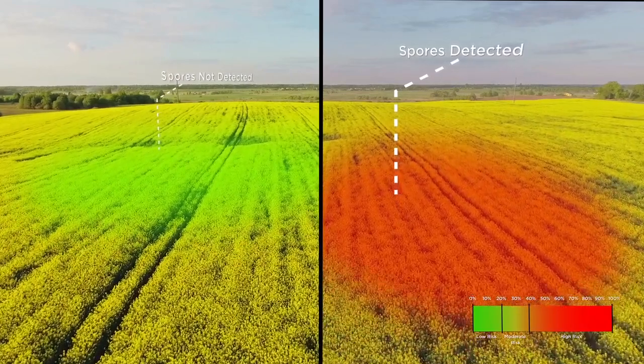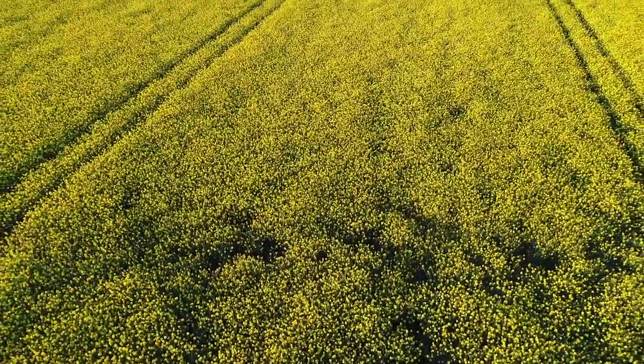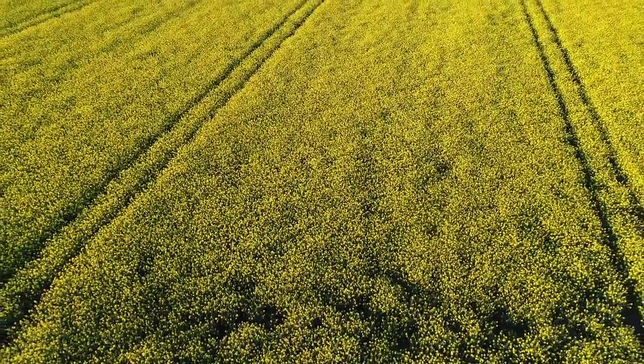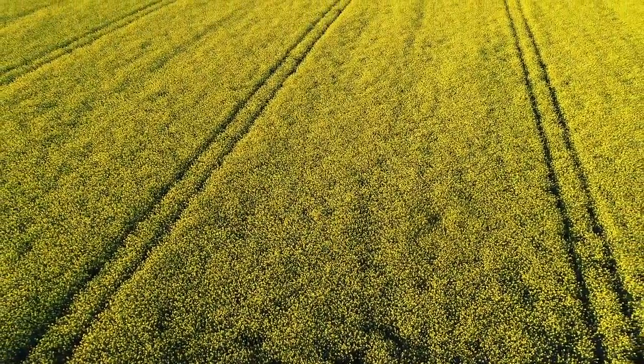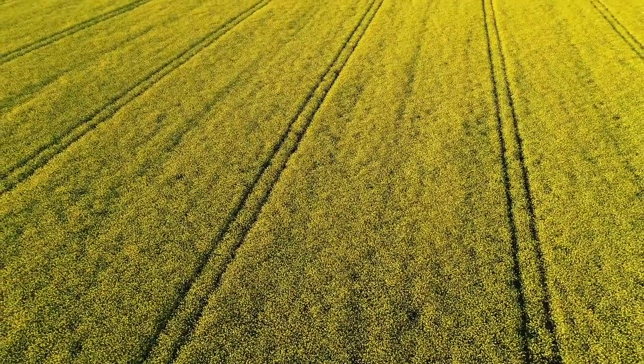If spores have been detected on less than 20% of petals, then there is a low risk of having yield losses that warrant the cost of fungicide at this time. Another sample can be collected and tested in several days to see if the risk level has changed.